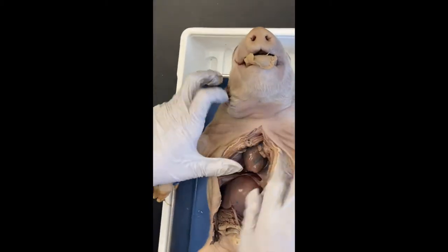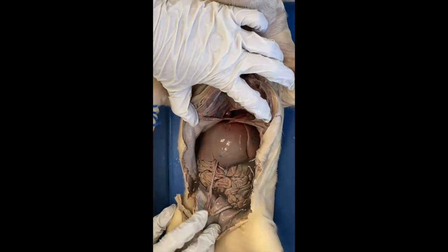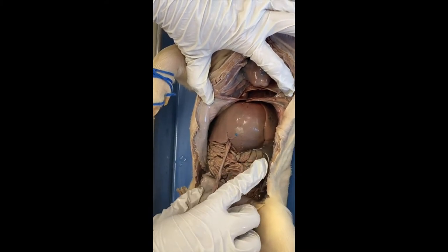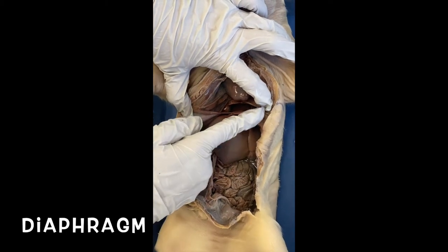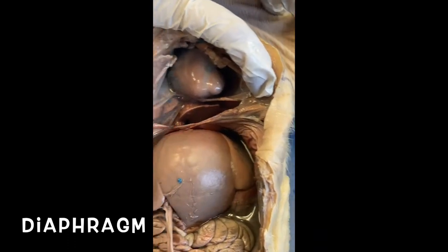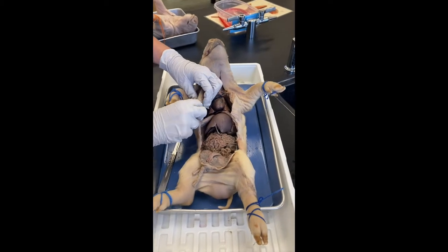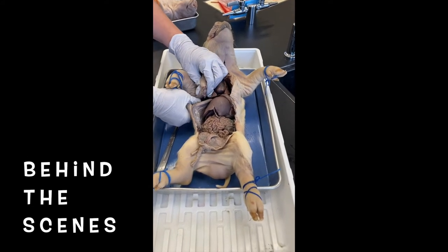This part's kind of hard to see, but I'm gonna clean this up a little bit, you guys. But here we are. When we look at this area, I'm gonna clean up. As we move into looking at them individually, I'm gonna drain this, which is what you've done in class. It's not fun to look at juicy organs. We're looking at the diaphragm. The diaphragm is here, separating our chest cavity from what would be our abdomen. All right. Just to clarify, you're just clearing away the extra tissue inside.